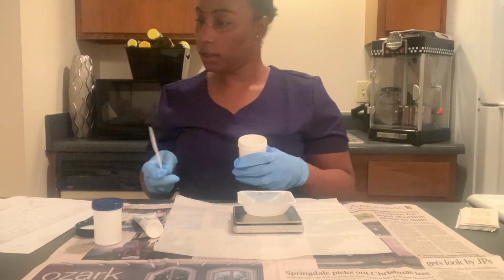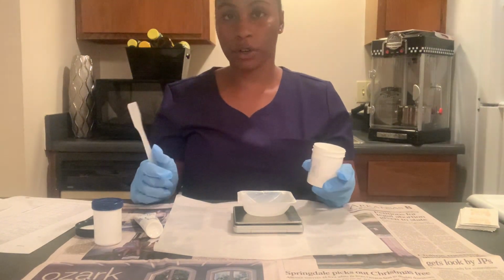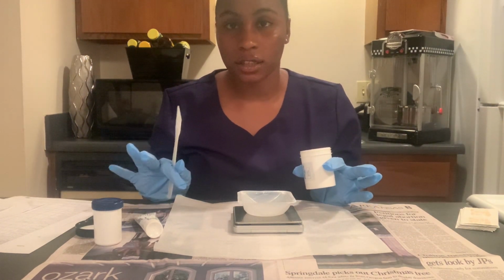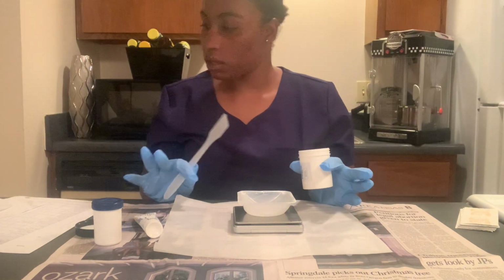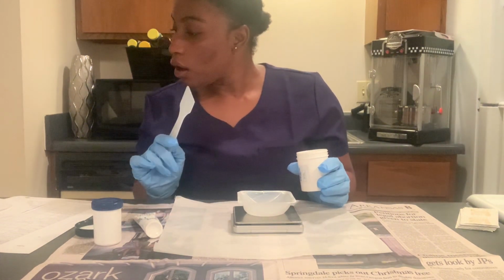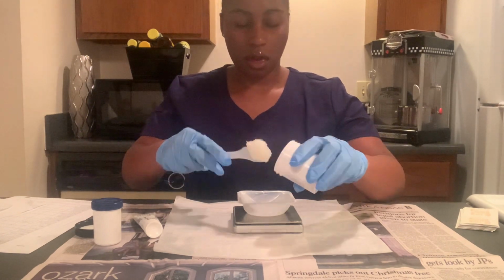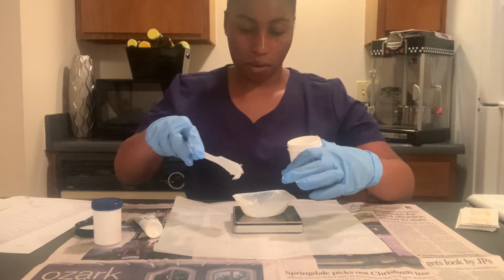I'm gonna take that. I'm gonna put it in the weighing boats. And with the ointment base, remember that it is 54 grams that we have to weigh, but it's not gonna be kind of exact. So we have the minimum and maximum weight allowed, which is given to us, which was 48.6 grams and 59.4 grams. So I'm gonna put all this stuff in here.